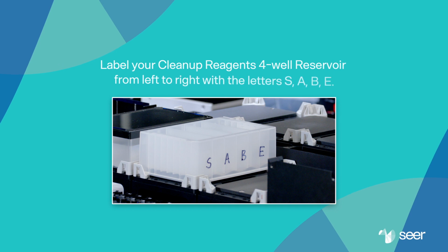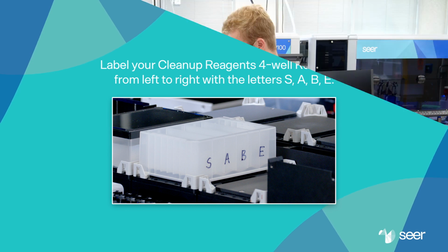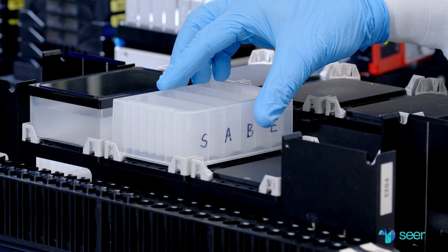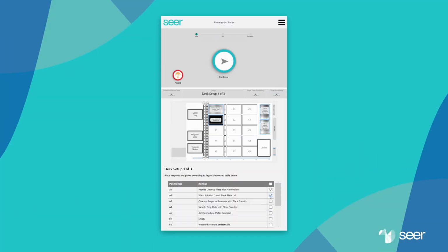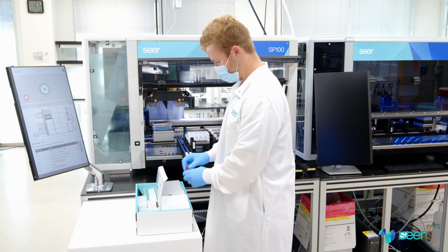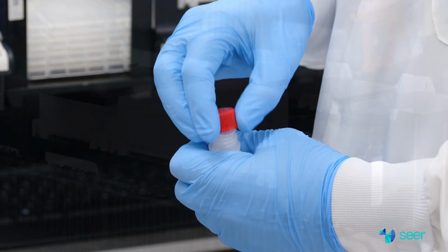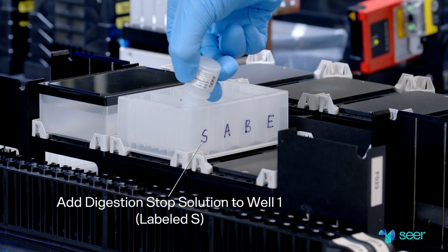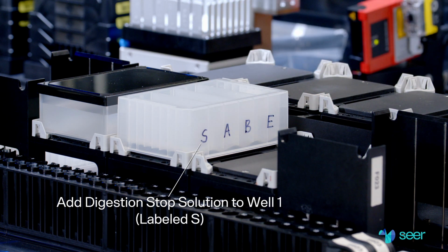Label your cleanup reagents 4-well reservoir from left to right with the letters S, A, B, E. Then load the cleanup reagents 4-well reservoir in position A3. Follow the prompts on the ICS to load the reagents. Pour 1 bottle of digestion stop solution into well 1, labeled S. Pour bottles from the front of the reservoir to avoid cross-contamination between wells.